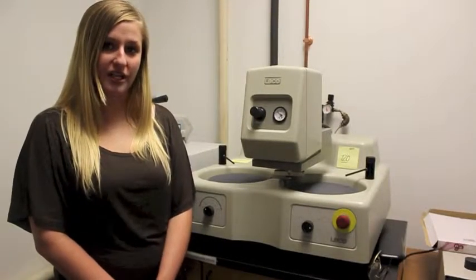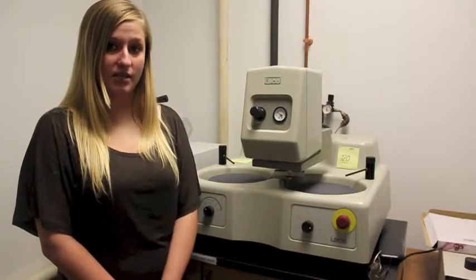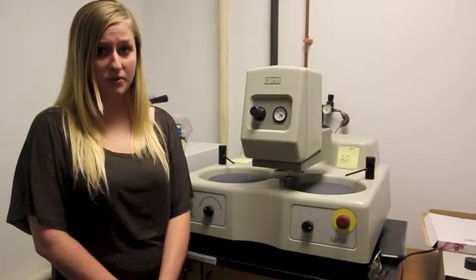LECO Spectrum System 1000 is a grinder and a polisher. It's equipped with two 8-inch oscillating wheels, which can hold up to six 1-1/4-inch samples at one time, thus increasing productivity. The 3-quarter horsepower motor powers both tables simultaneously.